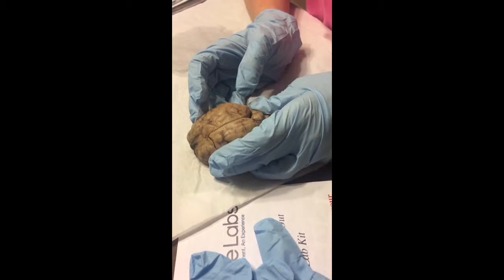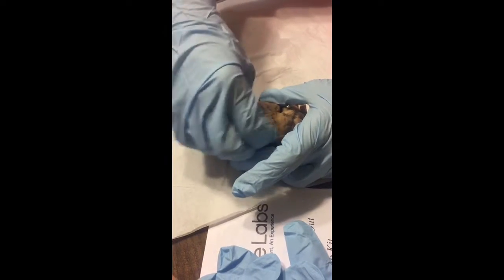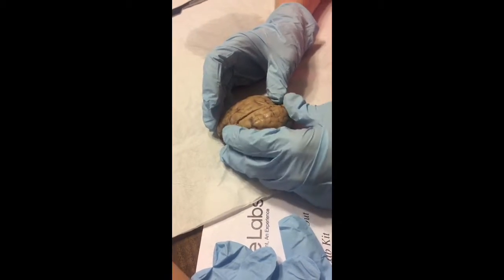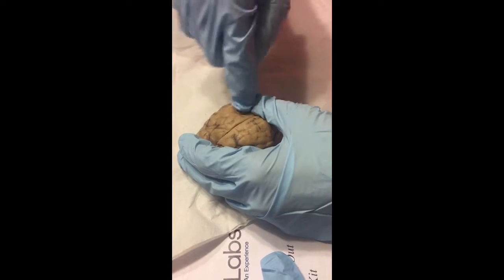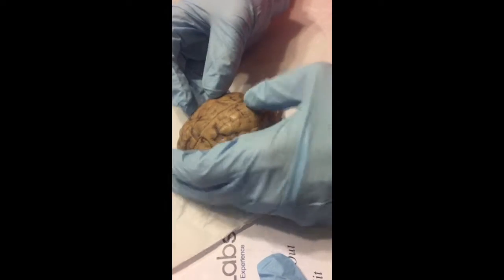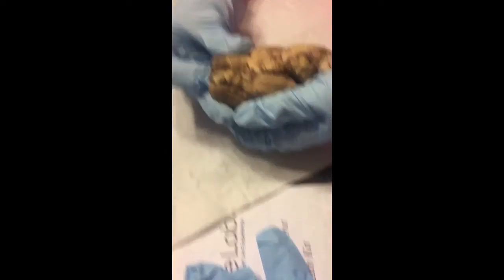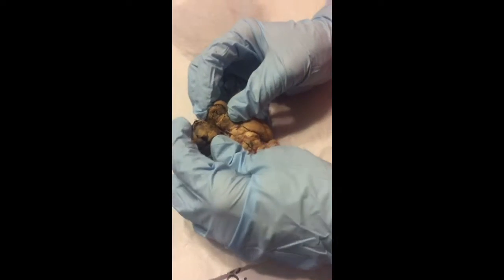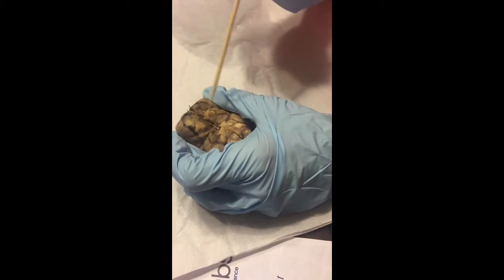The first term is dura mater, which is the outside layer, the skin here, the film. The cerebrum, which is all these little pieces here, that's the cerebrum. The longitudinal fissure, which would be, let's flip it over, right there in the middle.